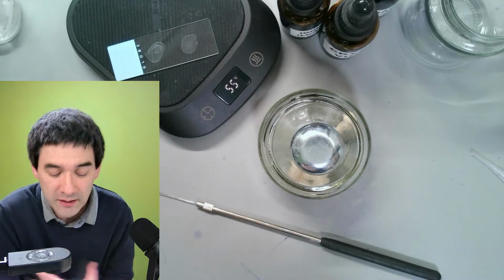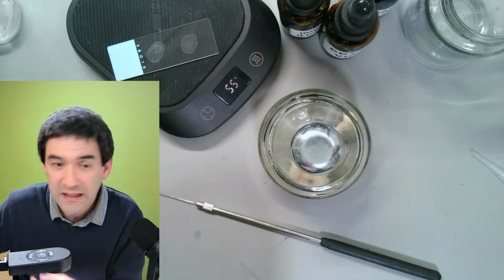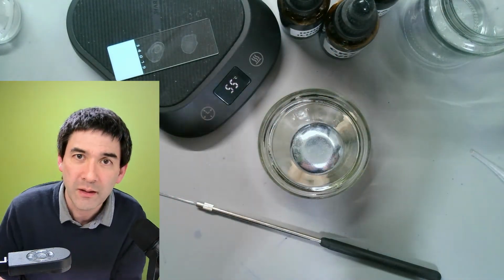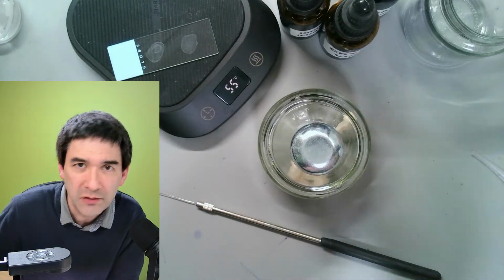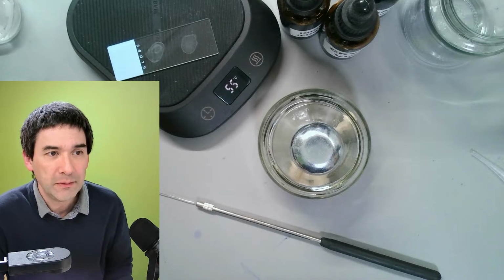But I just want to tell you that if you want to do this in a laboratory-grade way, then you cannot just take any old plate and do gram staining, but actually you have to determine the time and the age of the bacteria, the growth stage, and then you do the staining, right? Because old bacteria might stain differently than young bacteria, and so on. So this is a little bit the thing here.